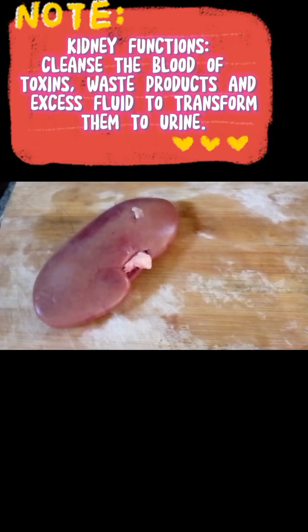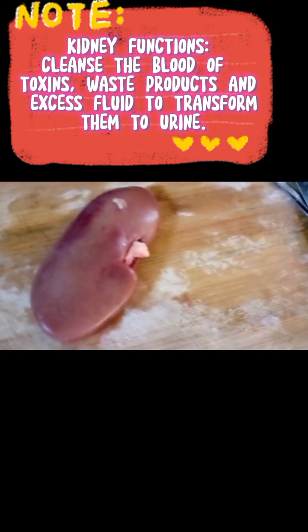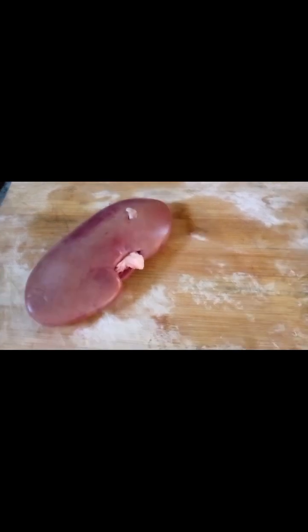Going to dissect a pig's kidney, locate its major structures, and trace the pathway of blood and urine. What do our kidneys do? Our kidneys clean the blood of toxins, waste products, and excess fluid to transform them to urine. Kidneys are bean-shaped organs that come in pairs.